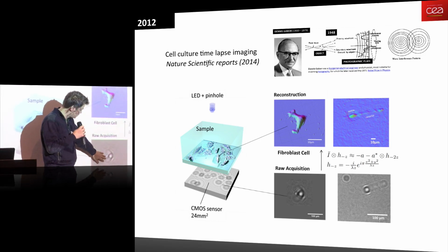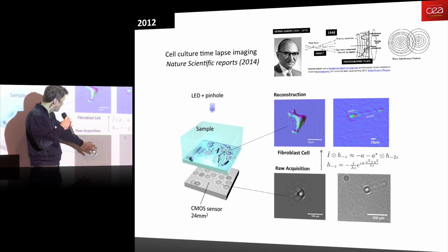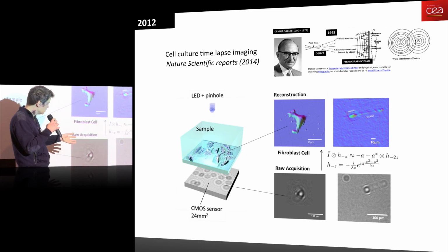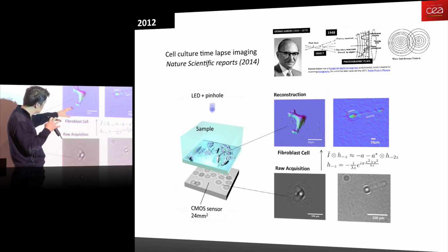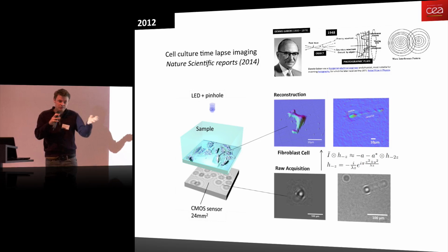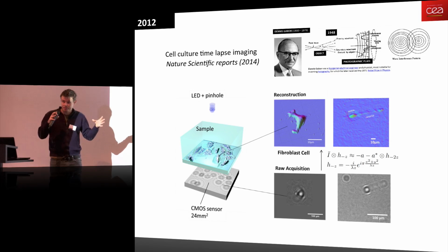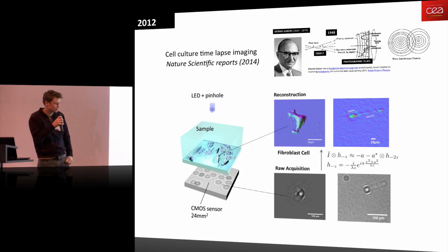This is the picture of the cells, I mean, in the diffraction mode. This looks like nothing to you. And then we have a computer to make the shape of the cells. When you look at the stone in the water, if you make a movie and you play it backwards, you will see the stone appearing. We do the same with the mathematics, with the physics.